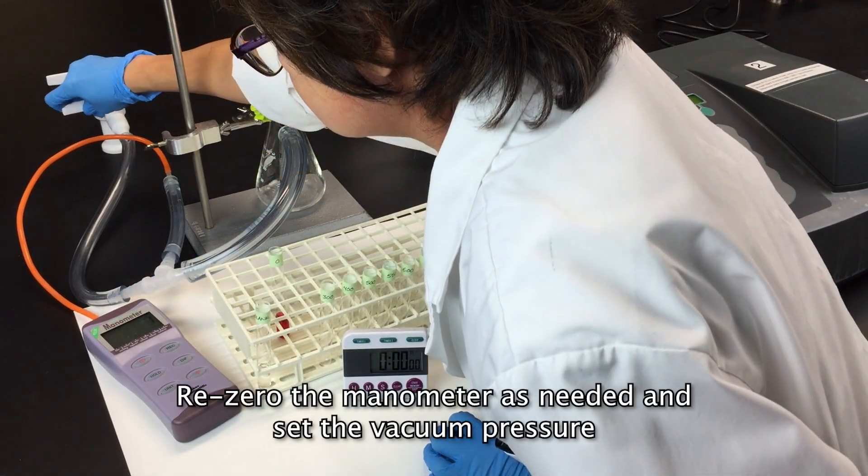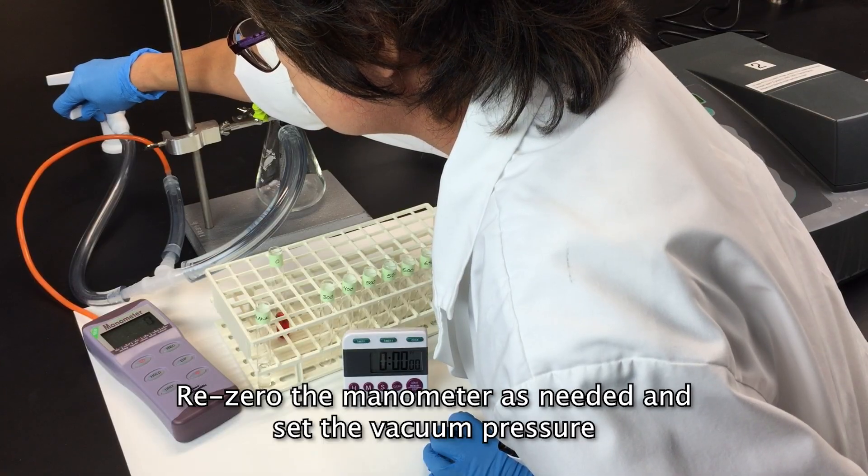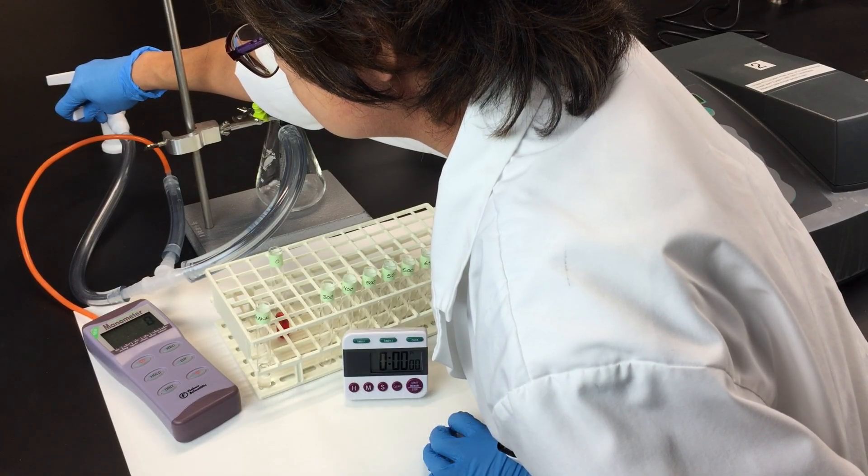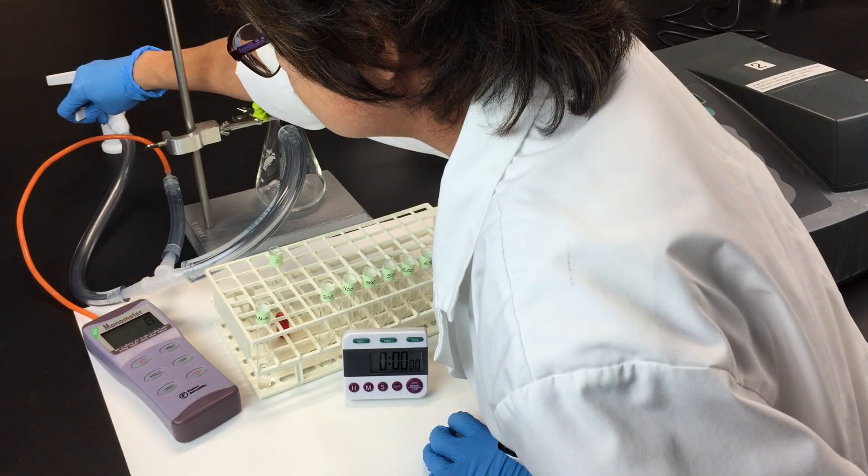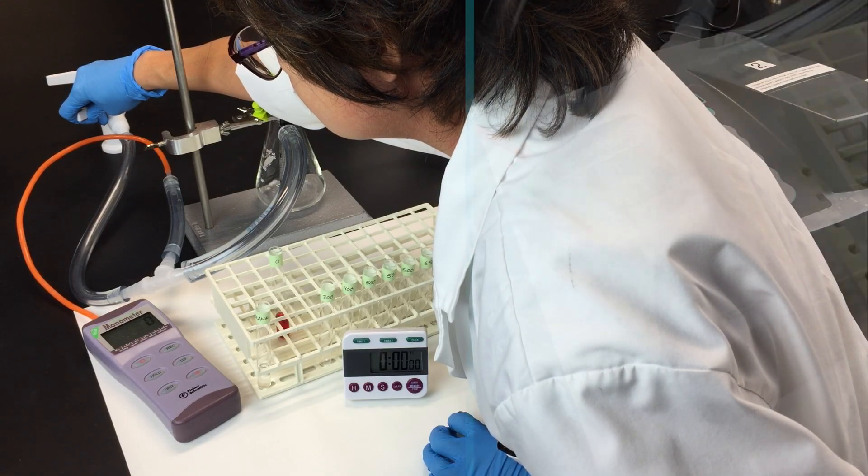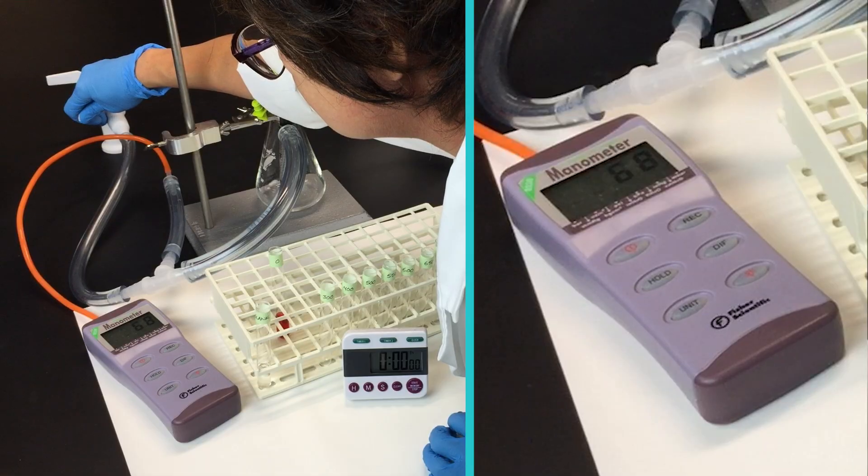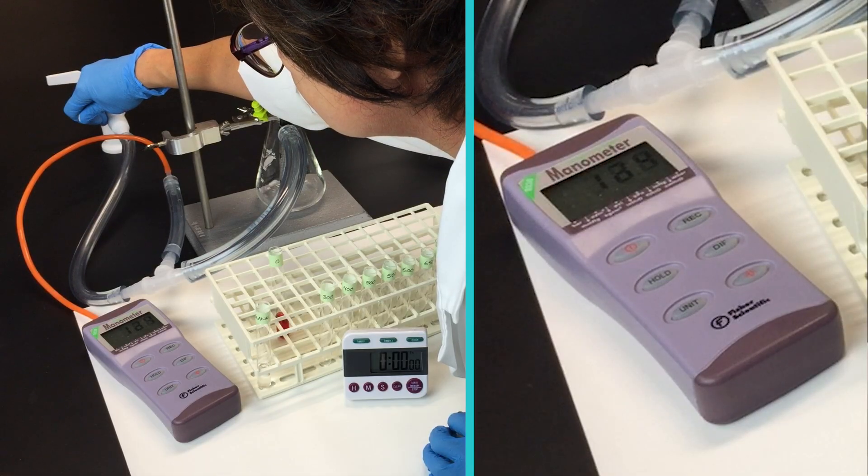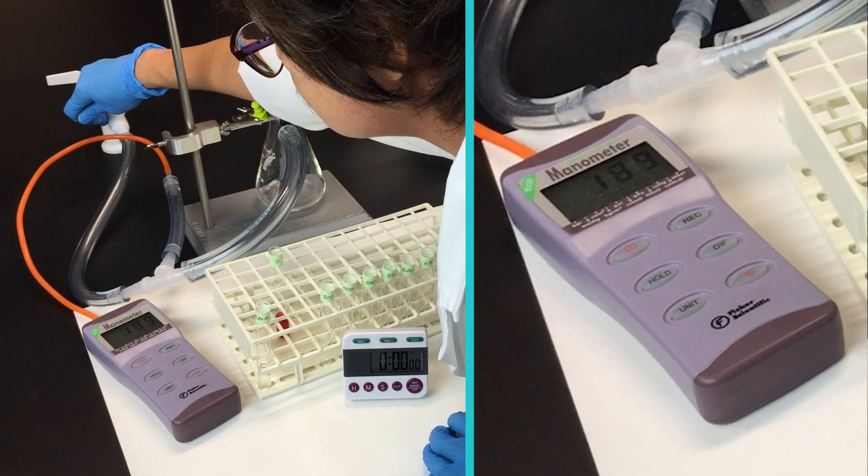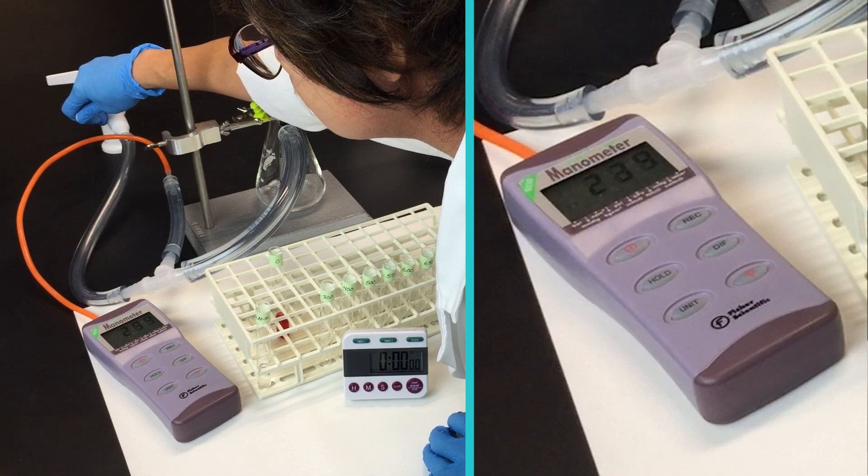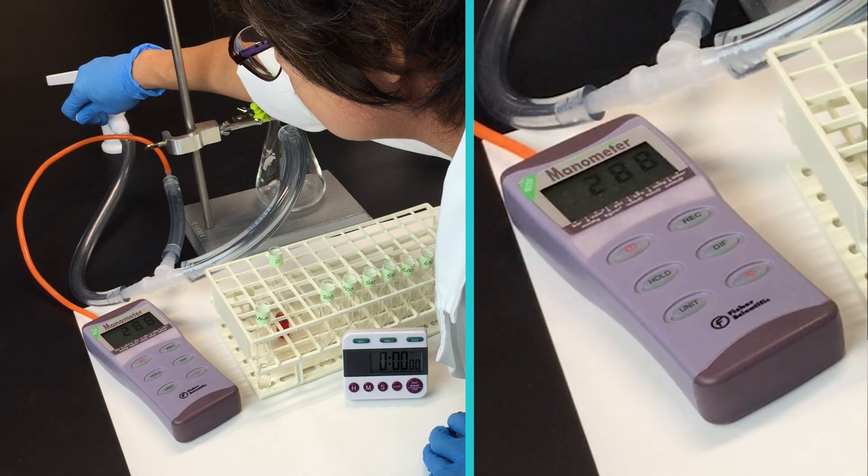Now slowly open the vacuum and increase it to 300 millimeters of mercury. You want to do this slowly and carefully because it's very easy to overshoot your target vacuum pressure. Once you reach your target vacuum pressure, nudge the valve back slightly so that it stops increasing.